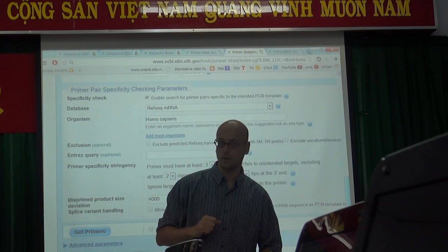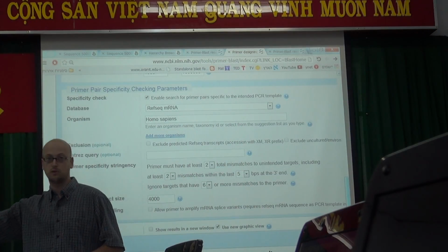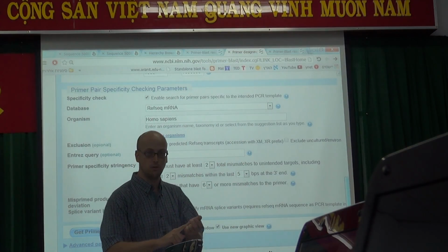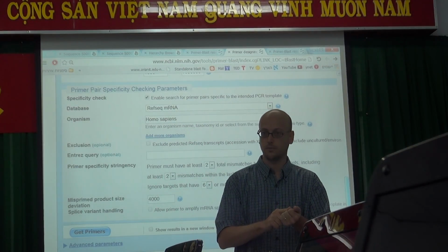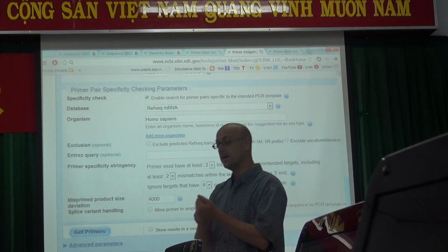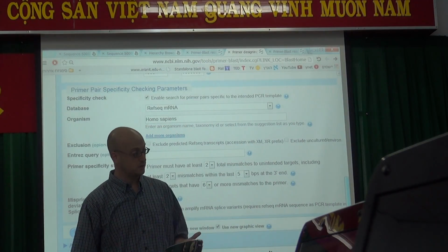If our primers work on Azospirillum, but also on Vibrio, and also on Actinomycetes, and also on E. coli, then the primers are not specific.